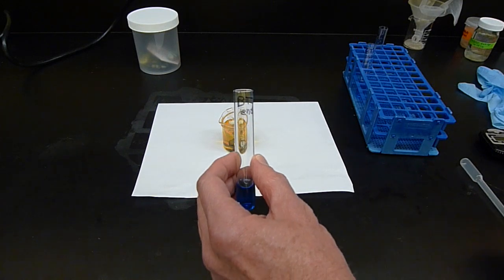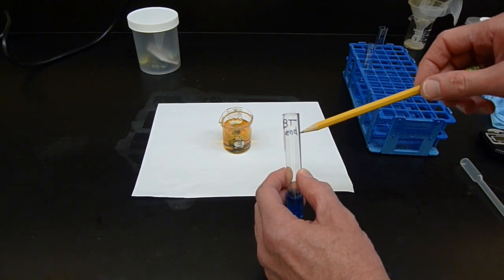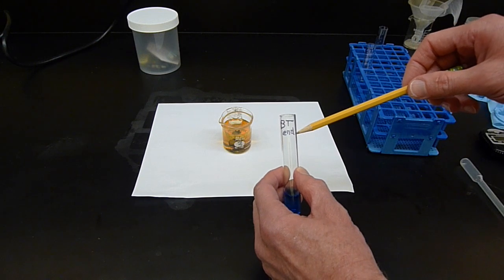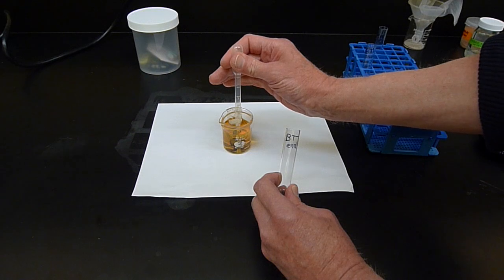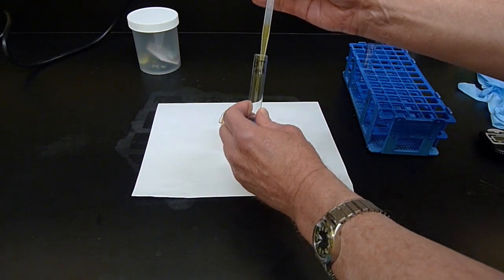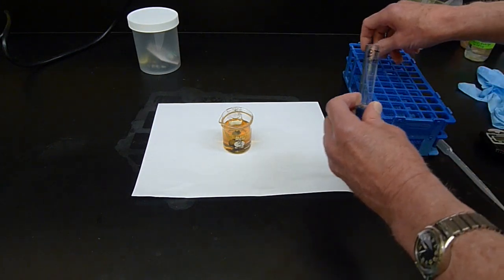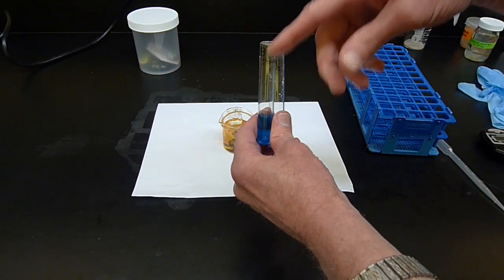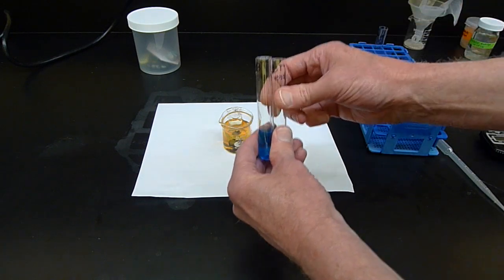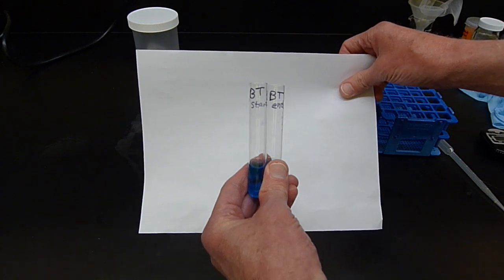Here's the tube we're going to use. I've got it labeled BT for Benedict's test, and it was Benedict's test sampling the beaker solution at the end of this incubation period. So I'm just going to withdraw some of the water from the beaker and put it into this tube. That's what we're going to use for a Benedict's test. Then here is the tube with the beaker solution for Benedict's test at the beginning versus the Benedict's test from the beaker at the end.